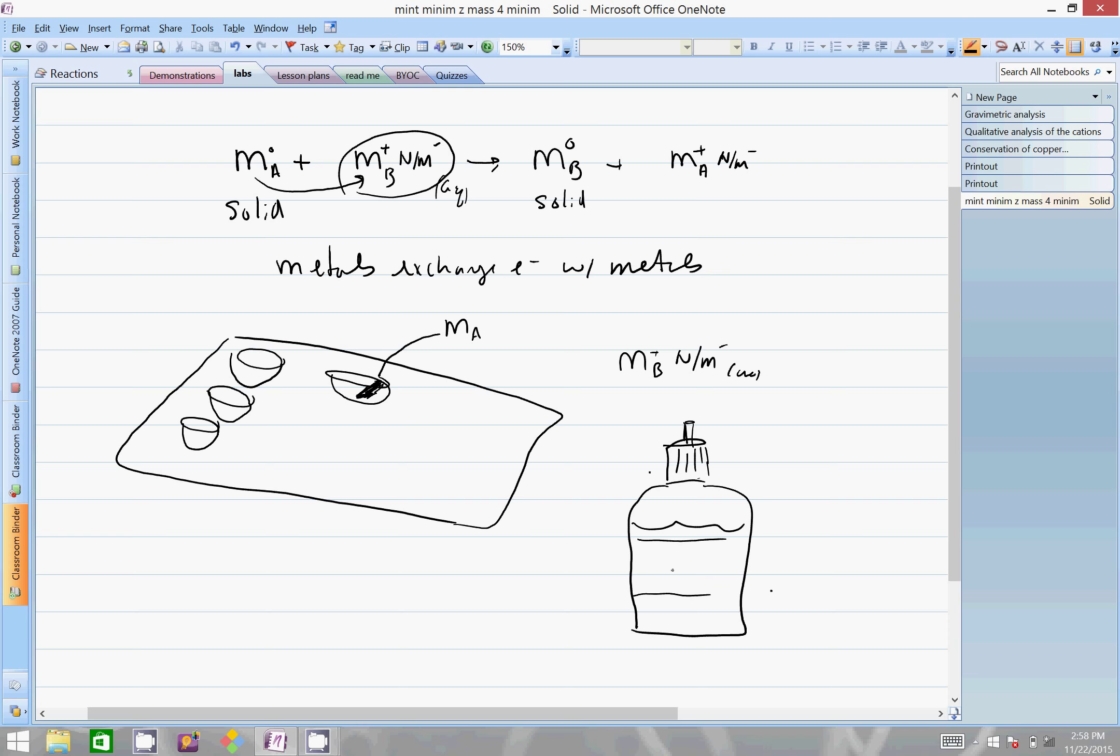When I drop them, I'll simply take this out and drop and fill it up. We would have an opportunity right there for this metal to exchange electrons with the other metal.